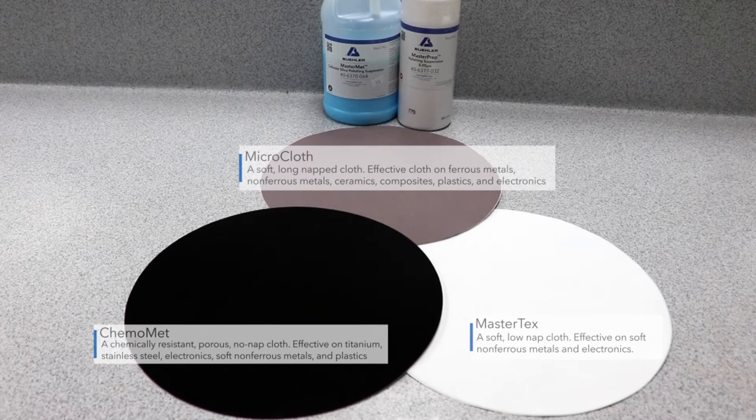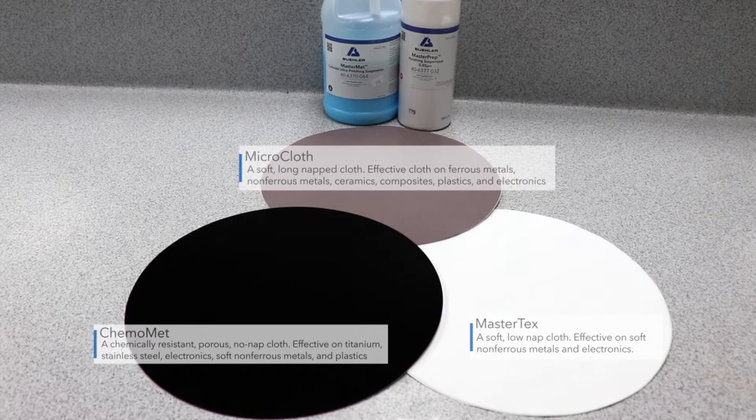Comomet is a chemically resistive, porous, no-napped cloth that is effective on stainless steels, electronics, titanium, and other refractory metals.